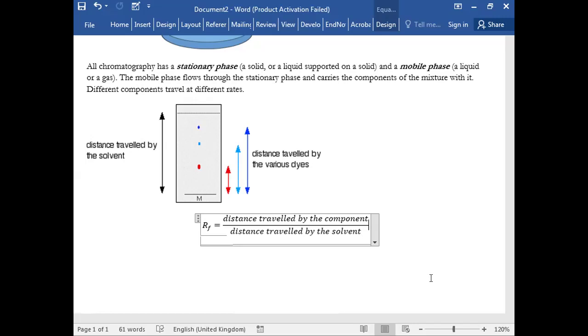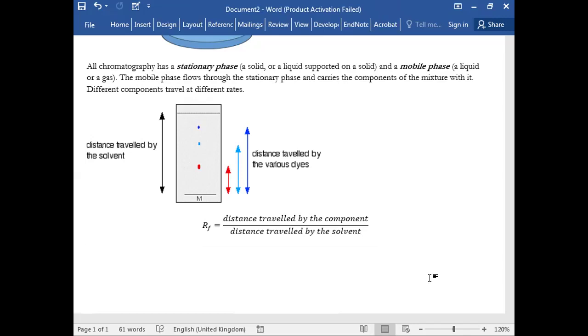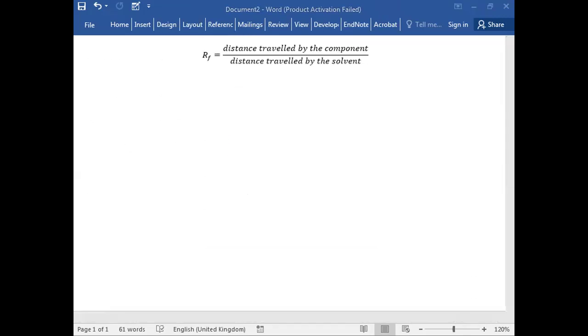और मॉडर्न डेज में तो ये वाली क्रोमेटोग्राफीज कम यूज होती हैं, इनका एनालिसिस भी इज डन मोस्टली थ्रू कंप्यूटर्स. मॉडर्न डेज में तो सारा काम ही कंप्यूटर एनालिसिस करके आपको देता है. एंड दिस इज नो नॉट द ओनली वे टू अंडरस्टैंड और एनालाइज योर substance. You do more tests, आपको और analytical techniques होती हैं, सबको combine करके and then you realize okay भाई, now this is what I'm supposed to have. So सिर्फ एक analytical technique से हम rely नहीं करते. Is this clear? Anything that is not clear up till this point?